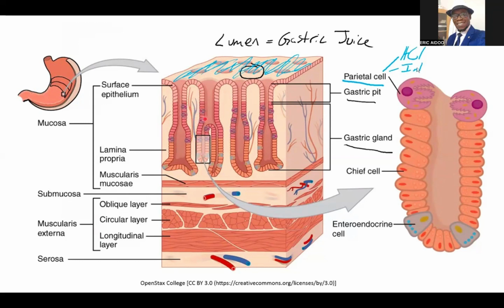And it comes down. When it is coming down, it is a space or a pit devoid of what? Lamina propria. Then it goes up, and you have the lamina propria there. It's like a solid pillar holding the epithelium. So that is how this is formed, and we call this the mammillated bodies. Then there are times you find, as we go ahead, that sometimes the submucosa will go with it, will throw some of this mucosa upwards, and that will form the rugae.